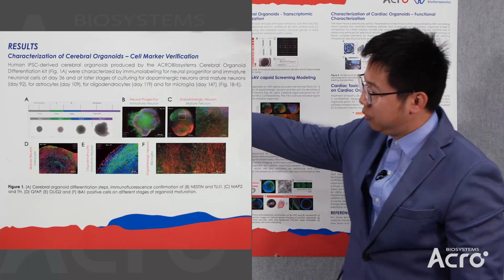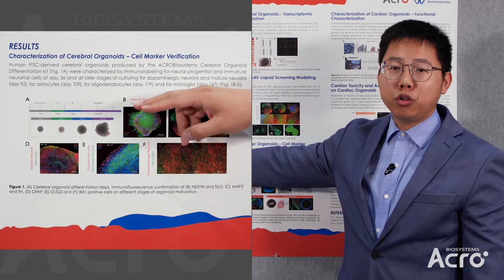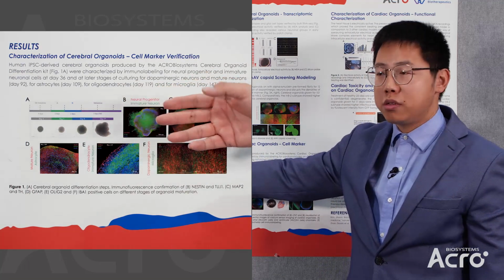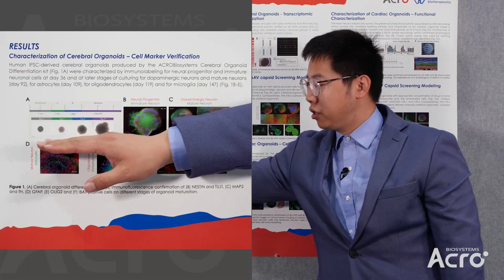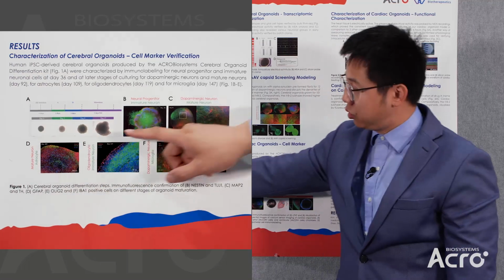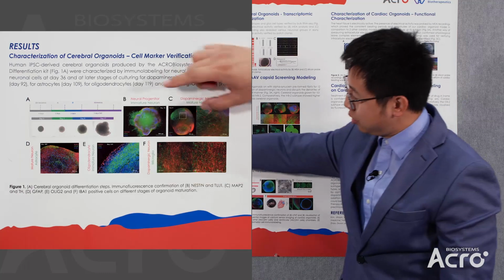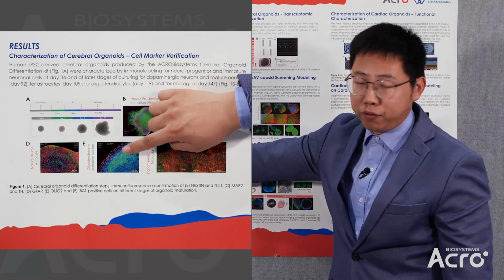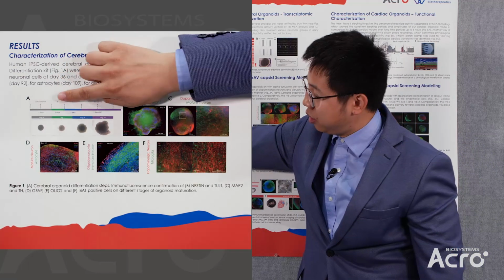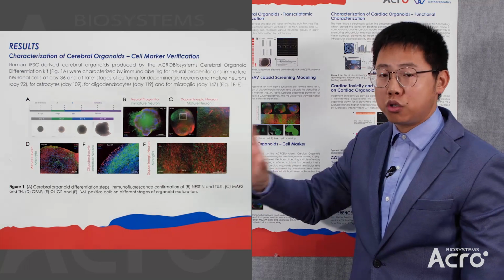Let's look at the differentiation results in phase 1. Following our internally validated protocols and using cell lines derived from human iPS cells, after differentiation you will see the single cells become organoids with different cell types. You can see the size and the edge of the shape. I want to highlight day 4, when there's EB formation. That's the key timing for the transformation from 2D to 3D.